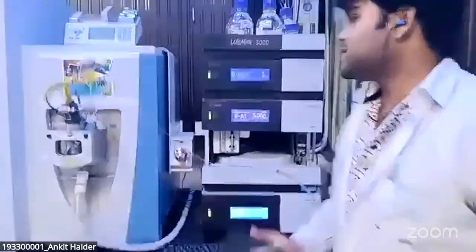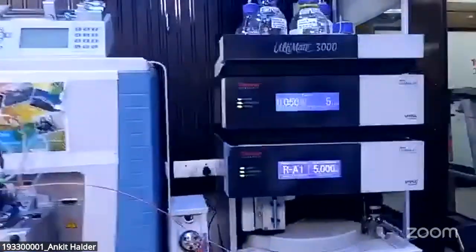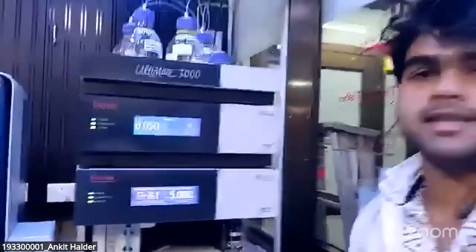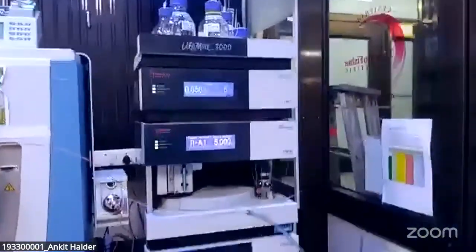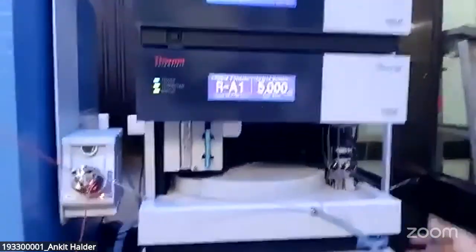Now we can see this entire mass spectrometry setup, and the HPLC, the high pressure liquid chromatography, is coupled in this instrument. In that system, you see LCMS, here the HPLC is there, and the model name is Ultimate 3000. So you can see this HPLC is quite different from the NanoLC. Okay, so there are 1, 2, 3, 4 different compartments.